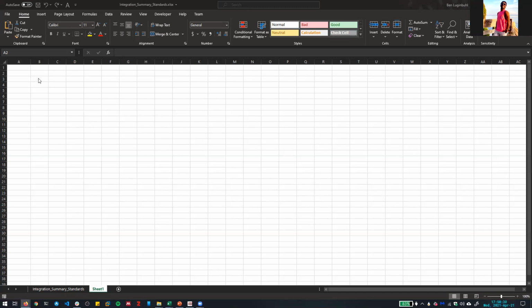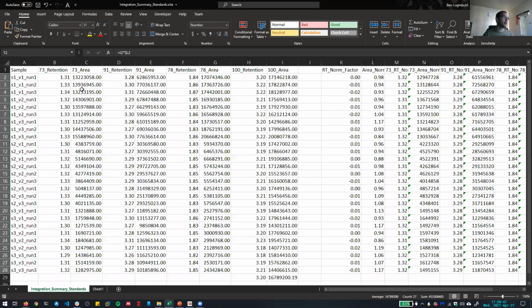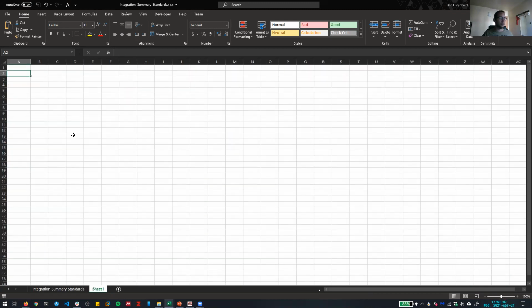Anyone? Would time be one of them? We don't need the time, right? Because all that's been accounted for in this stuff here. We basically just want, for each of these samples, the standard one should have a certain concentration of the MTBE and the toluene and the benzene and the D8 toluene. So we need to know the molarities of each of these things for each of these different standards. And there's 3 different standards that we prepared, right? Different concentrations of those. So what are we given in the manual there?